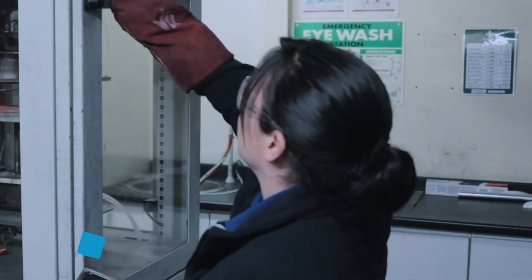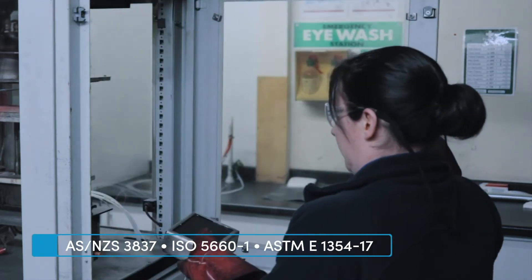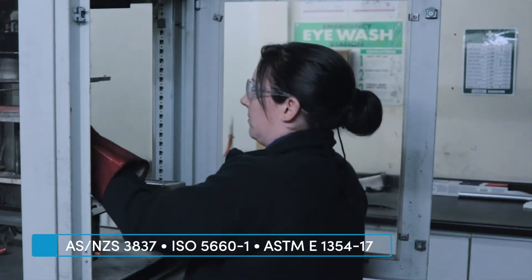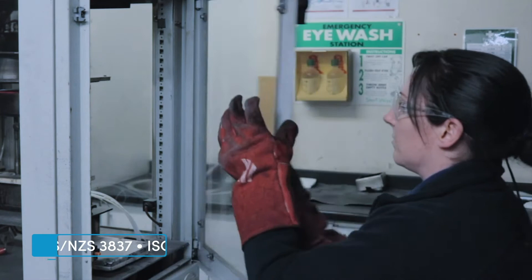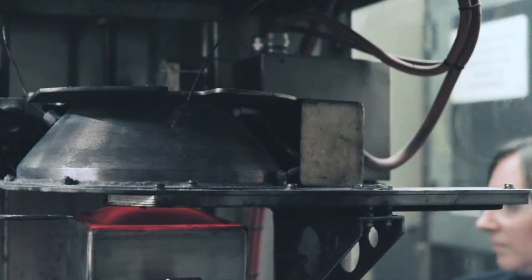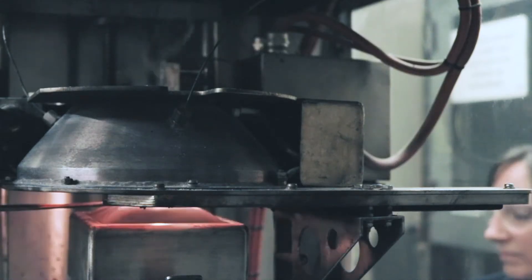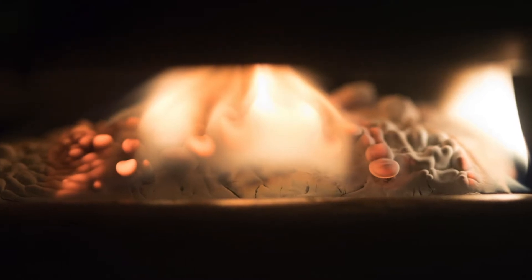The AS NZS 3837 ISO 5660-1 or ASTM E1354-17 is a small scale calorimetry test. It is one of the most versatile bench scale instruments for measuring the reaction to fire properties of combustible materials, and in Australia it is often used to predict group numbers in accordance with AS 5637 part 1.